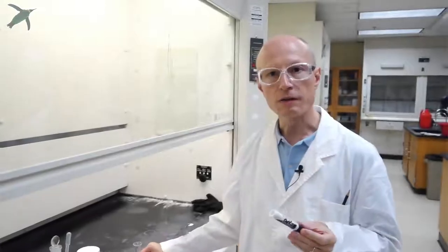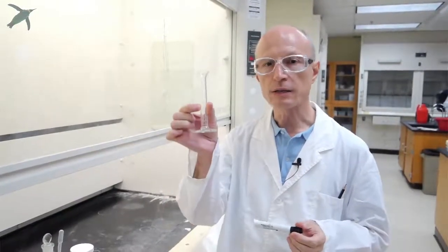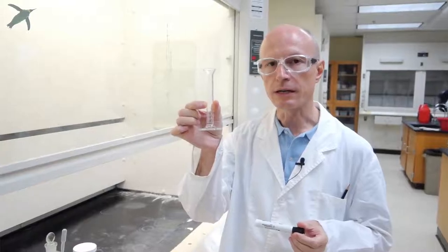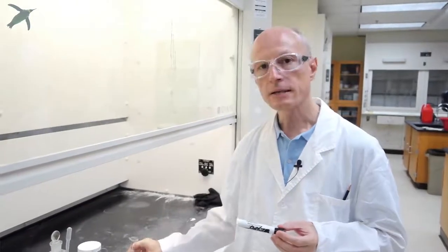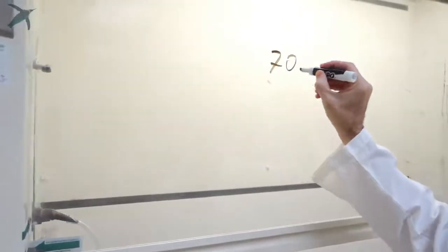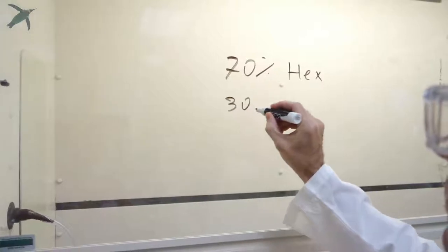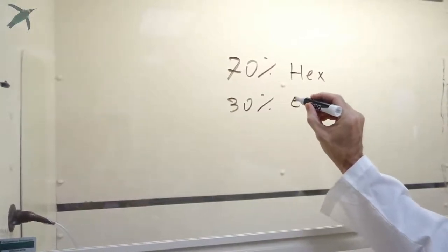How do you make the solvent for your TLC chamber? You want to use a 10 milliliter graduated cylinder, and let's say you need to make 70% hexane, 30% ethyl acetate.